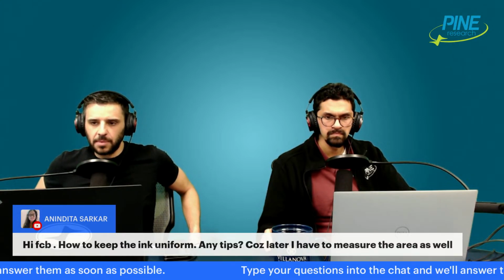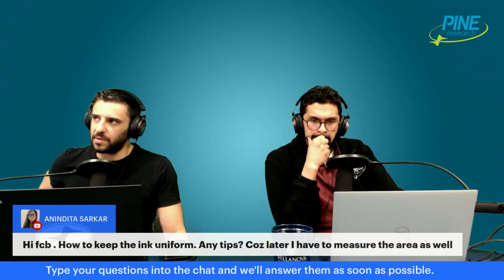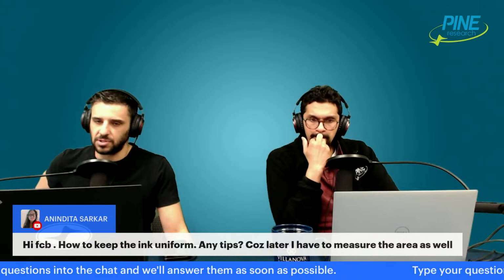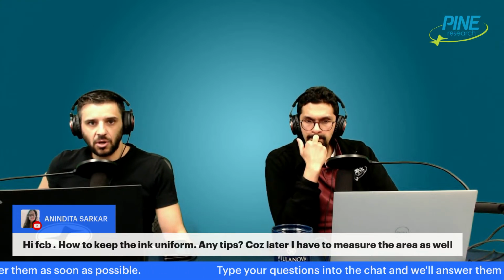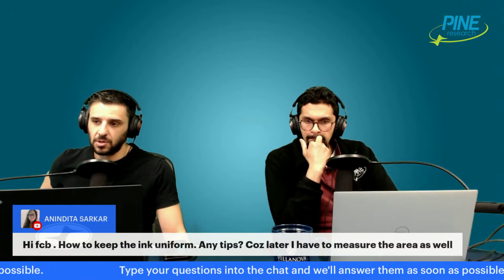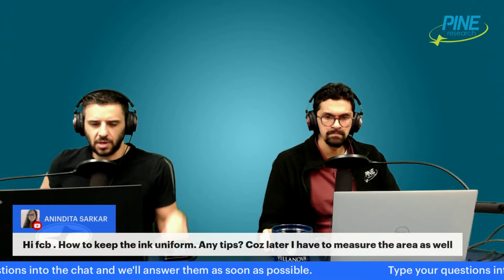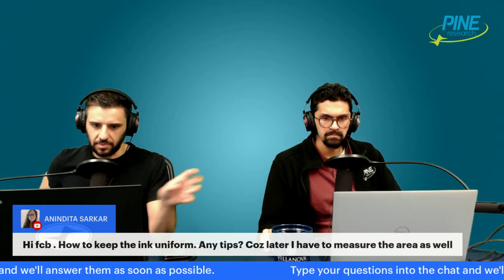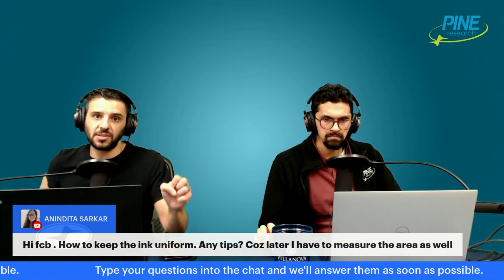The uniformity comes from a couple of things. Oddly enough, it has been observed, and I'm not sure if I fully understood why this is the case, but it does seem to be the case, that sonicating it in cold temperatures sometimes helps. So one of the things that you can try, Anindita, is you have a sonicator. Usually it's like the tub, and it has a knob on the front that starts the sonication, right? Add ice cubes into the water.